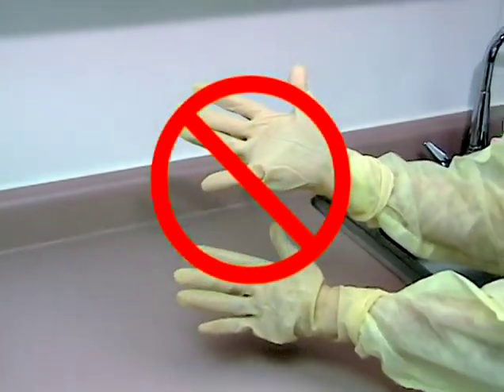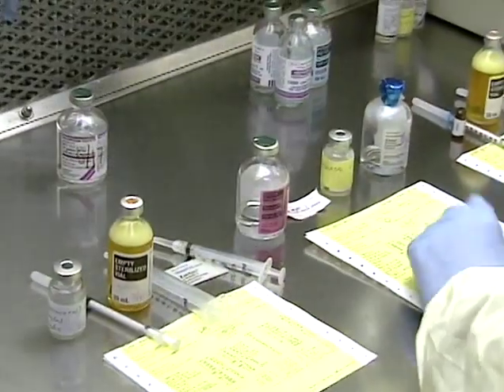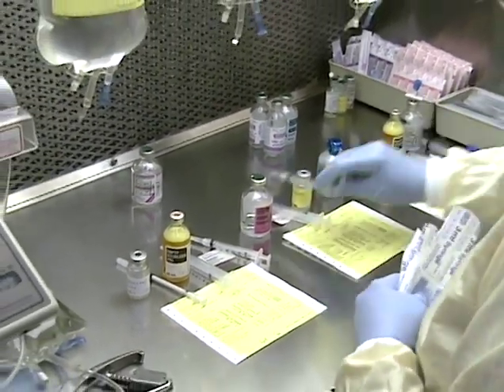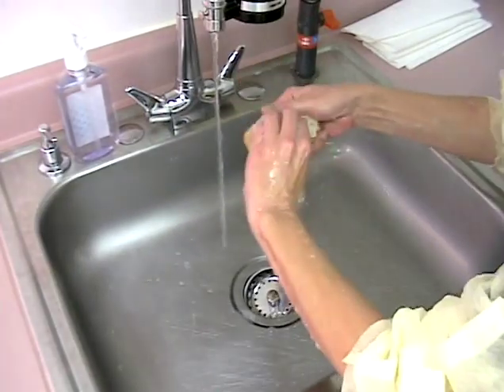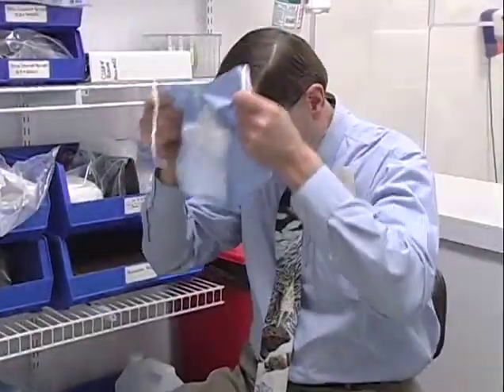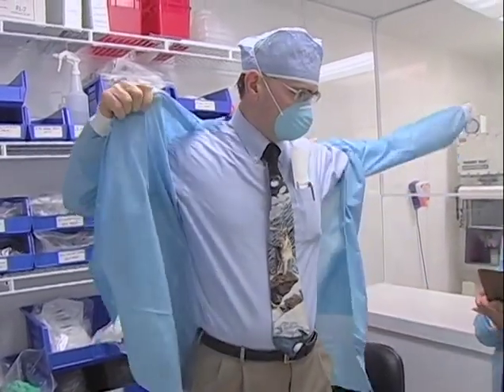Gloves should not be considered to be sterile during the compounding process, even when sterile surgeon's gloves are initially used, because they become contaminated as soon as non-sterile vials, bags, and other working materials are handled. The following procedure should be carried out during garbing. Upon entering the ante area, personnel are required to scrub the hands and arms, allowing them to thoroughly dry. All gowning except gloves should then be donned prior to entry into the buffer area where the PECs are located.